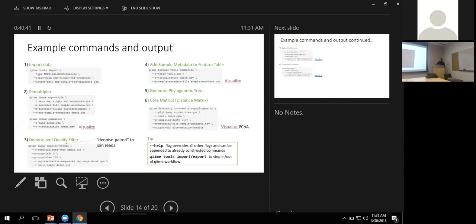So if you're interested in, you know, what happened at a specific point in time, you have options to set the shape of these different points based on a separate metadata category. So we can do days since experimental start. And then these are the different values, and this is the shape for each of them. So if we're interested in day 84, we can change those to cones. And now we can see that, you know, within the gut sample, this is where it ended up. This is an improvement because with QIIME 1, you weren't able to do this. And so you had to do a little more work to kind of tease out these details.